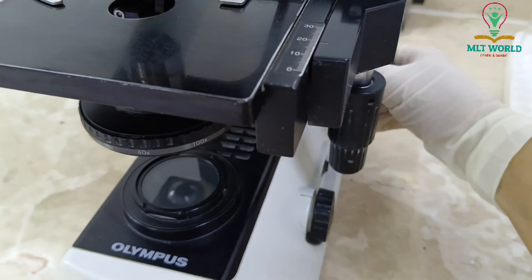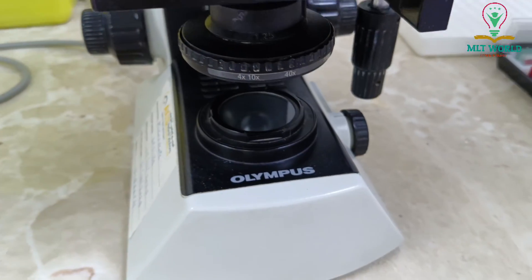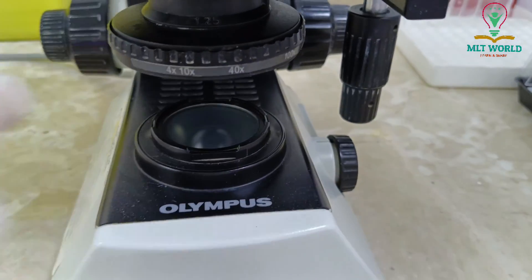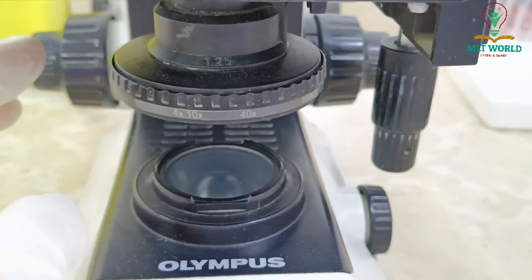After reading any slide, you have to discard the slide and move the coarse adjustment down. Always keep the coarse adjustment down. Only when you place the slide and start reading do you move the coarse adjustment, then bring it back down when done.